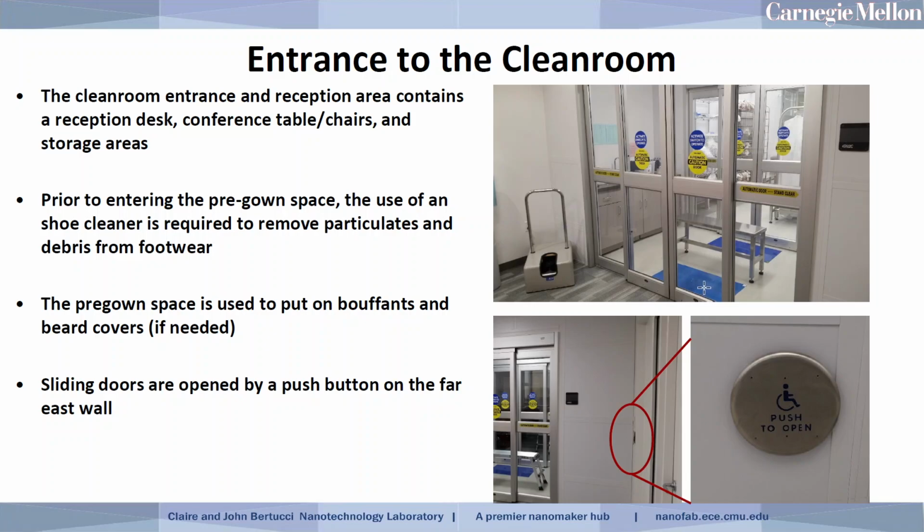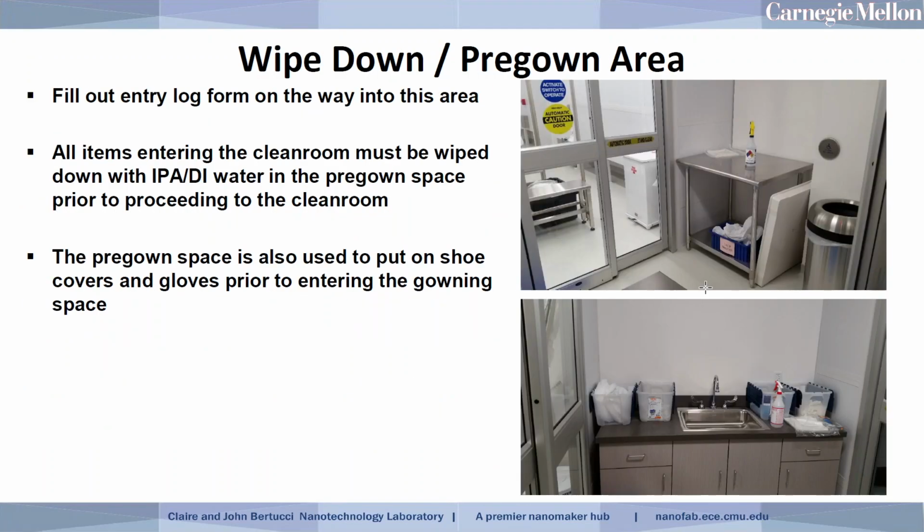As we progress into the pre-gown space, this is also our wipe down area. You want to make sure that you fill out the entry log form, a link to which is posted on the sliding doors that lead you into this area. So you want to make sure that you're logging in and out of the clean room each time that you enter or exit.